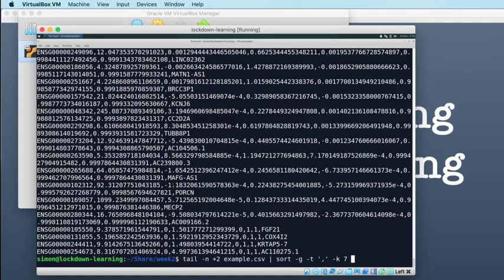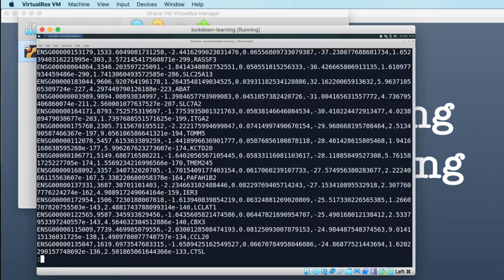So we can pipe that into less to see the most significant genes at the top. So here's the top of the file. And you can see this gene RASSF3 has a p-value of 3.57 times 10 to the minus 299, which is an inconceivably small number. So this is a statistically extremely significant result. It's a slightly worryingly small p-value, actually. You can see that our sort has worked, that our smallest p-value has sorted to the top of the file, and our largest p-value has sorted to the bottom.